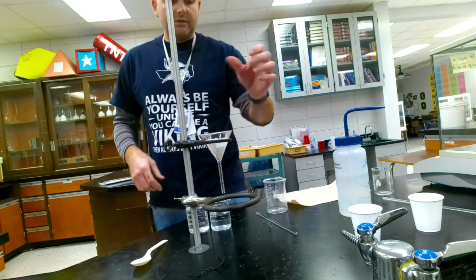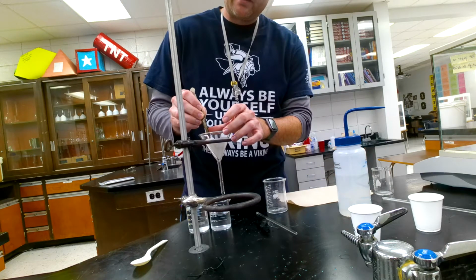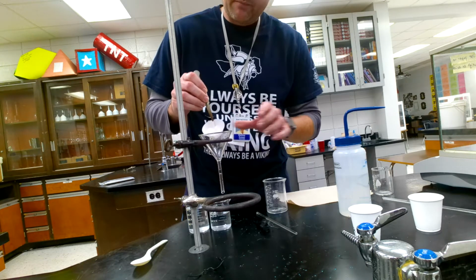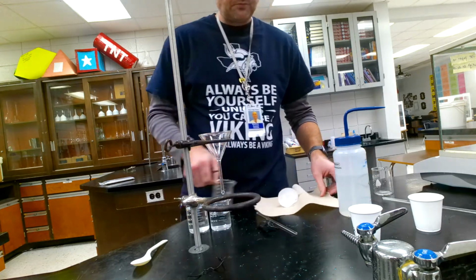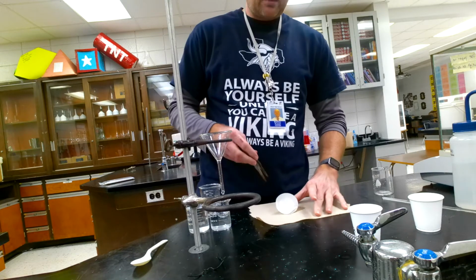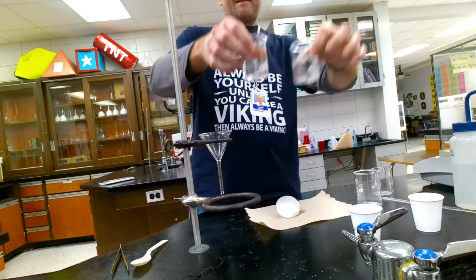All right guys, we are done filtering, and all I'm going to do is use some tweezers to try to work this guy out of here, because it can be a little crazy. When I get that, it should come right out, and there we go. I'll let it sit overnight, and I will let you know the results of this, and that's going to be it.